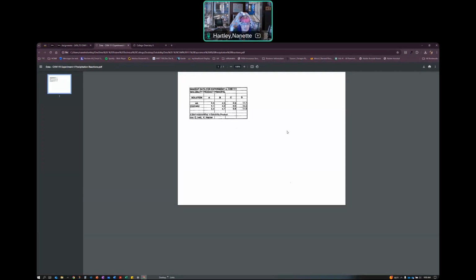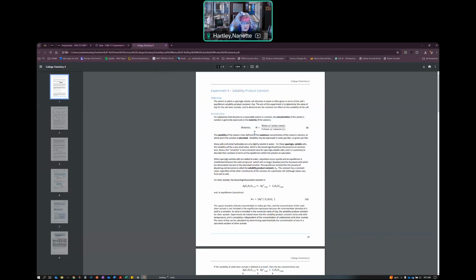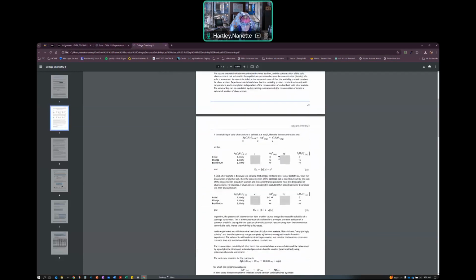What this tells you is that for each of these solutions, this is how much of solution A you would be running. You would run a solution, and this is how much of the titrant you would have put in for the 3 replicates of that particular titration to get to that endpoint. As it states in the lab manual, you've done this titration.